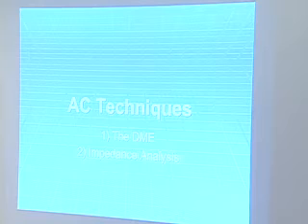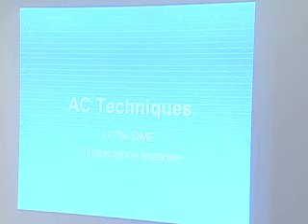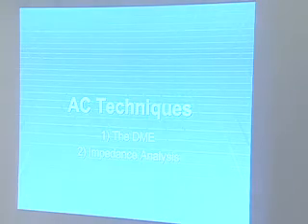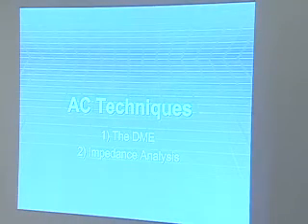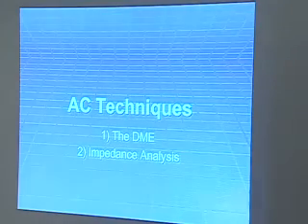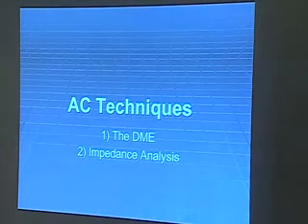The technique of polarography was developed, and it was developed for the dropping mercury electrode, the DME. And although that is typically considered a DC technique, in fact, it's an AC technique, in that it involves a time-dependent change in the current on a rather fast time scale. So I thought I would throw that in with AC techniques for completeness, and we'll start there with dropping mercury electrodes and polarography. Go over that quickly because you really already know that, even though you don't know that you know that.